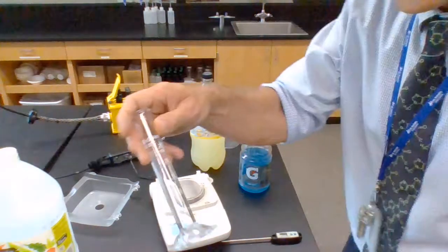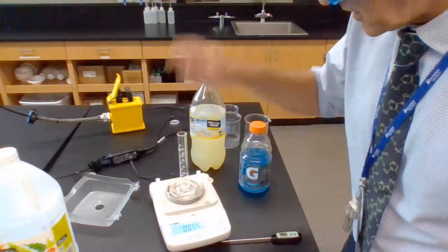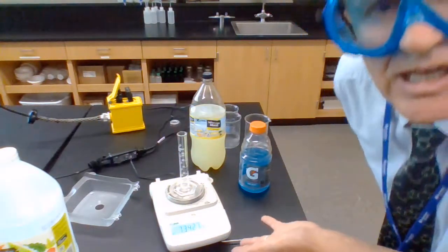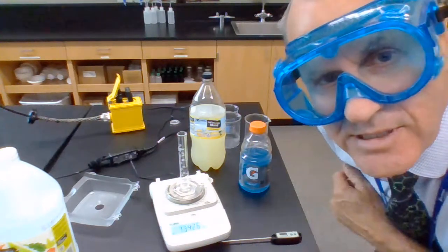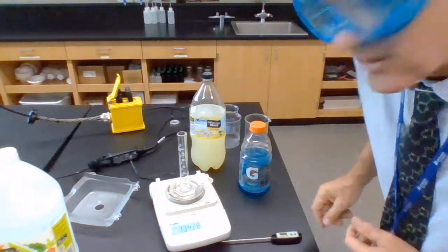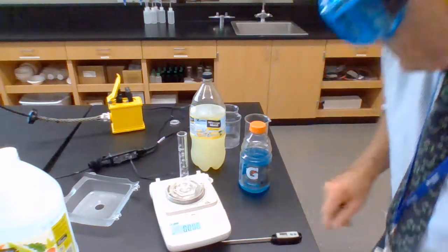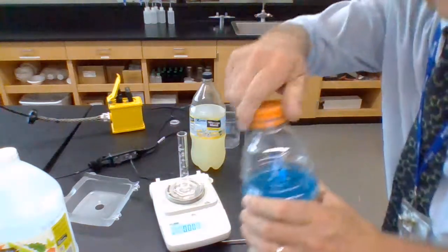So let's see what we do if we have got all this equipment. Firstly, we've got a measuring cylinder. And we pop it there. And it's a certain number of grams in its mass. But we're not interested in how many grams that is. We're going to zero that. Then we're going to take some of the drink.